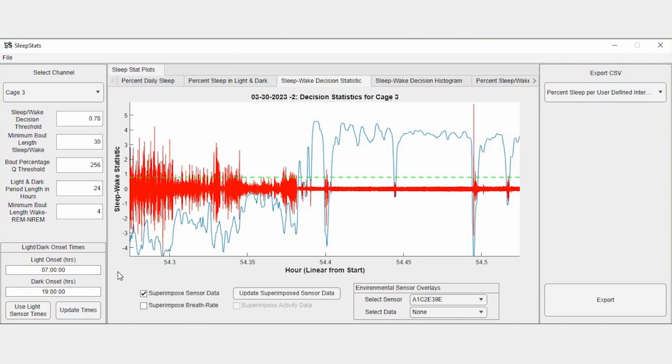At this time scale, some of the signal properties correlated with sleep and wake can be observed. Notice the higher, more irregular amplitudes are in regions classified as wake, and the lower, more regular amplitudes are in regions classified as sleep. We can also pan to another area.